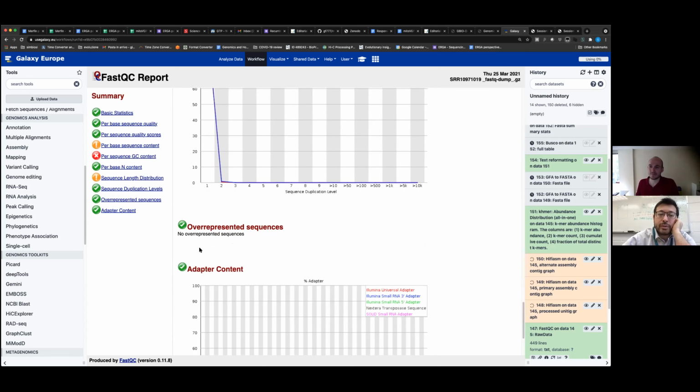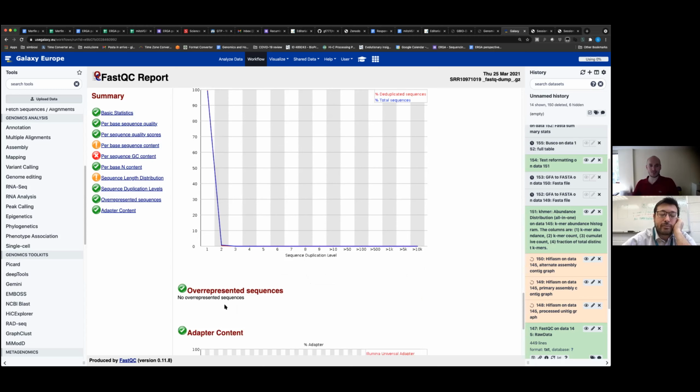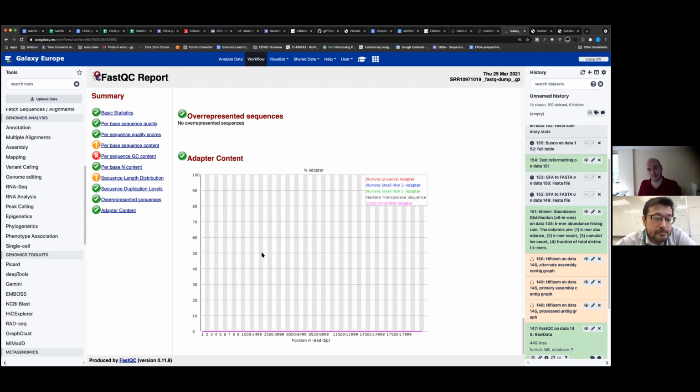But we're talking about 15 kb reads, so the chance of finding the same reads multiple times is low. Well, this would be for the sequence duplication. Overrepresentation is just if there is a barcode or some contaminant. So it doesn't matter if it's repeats or stuff like that. But again, here there is nothing.